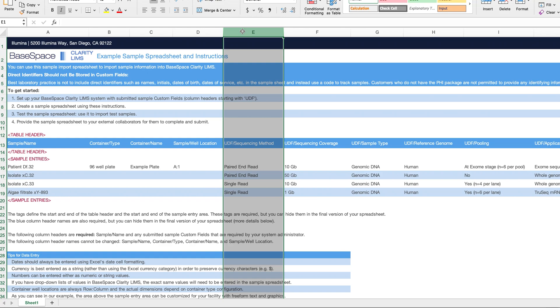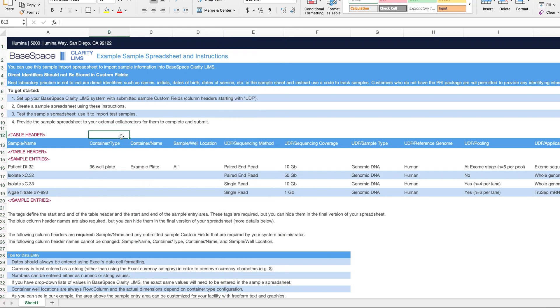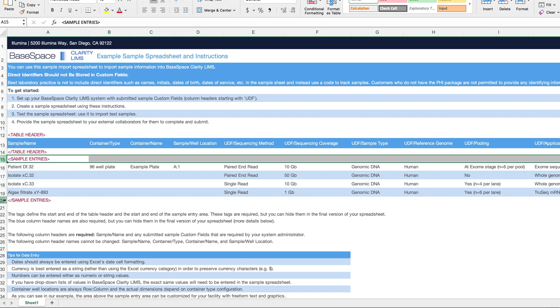Custom fields can be updated to any field name you want, as long as the field is configured in Clarity LIMS and on the template it is in the format UDF slash name of field, between the opening sample tag on line 15 and the closing tag on line 20.